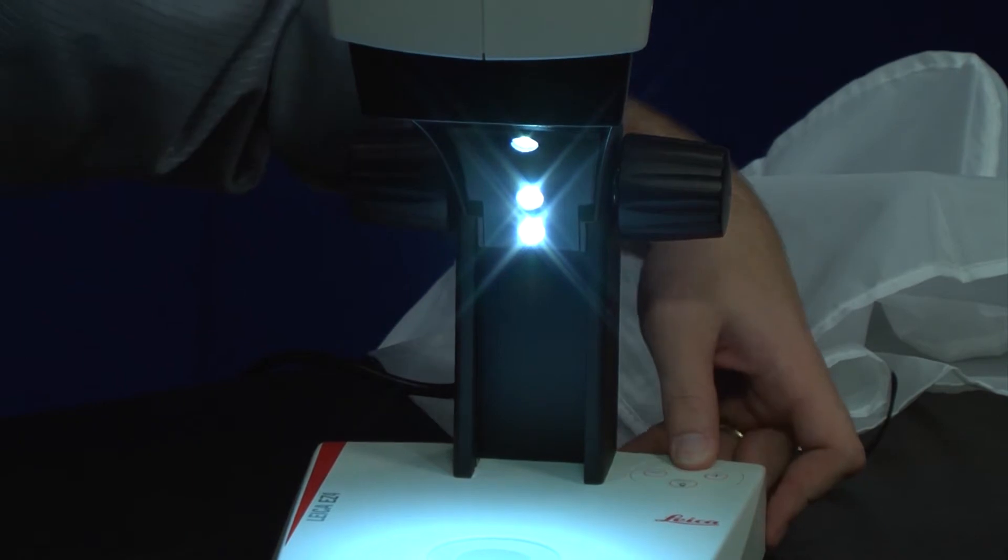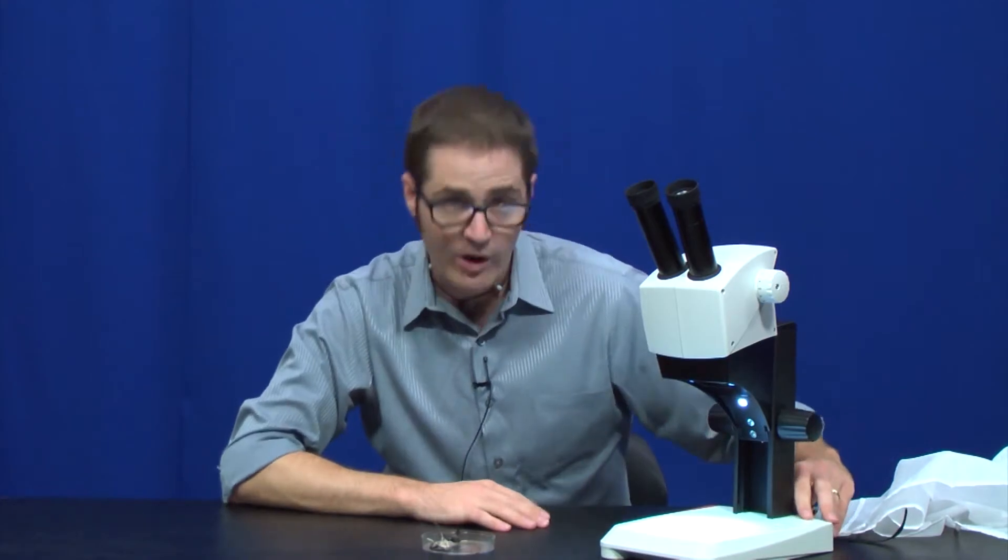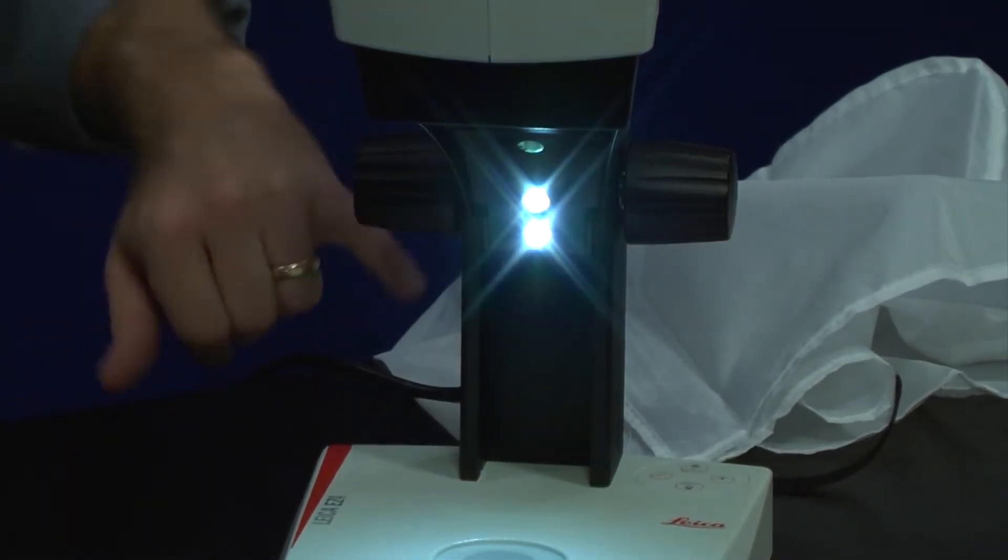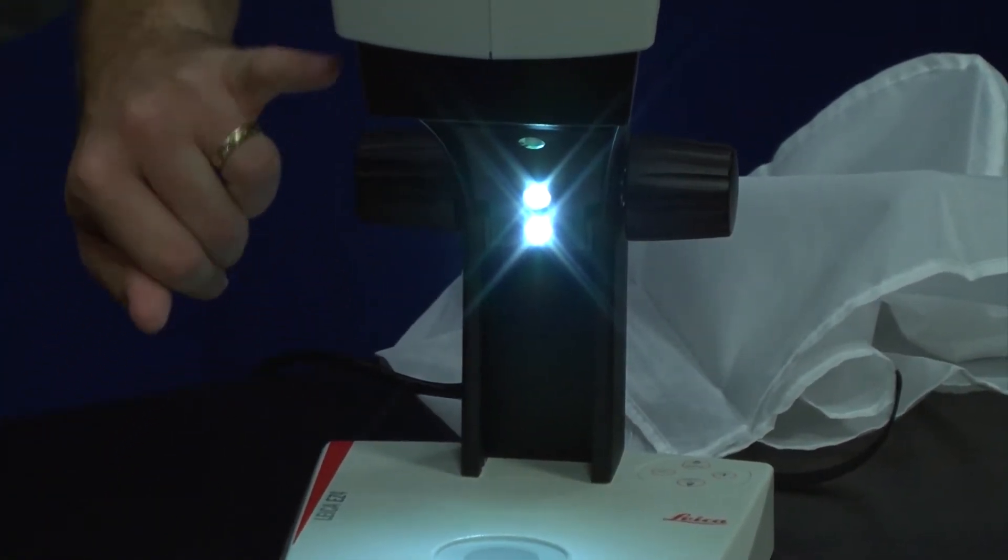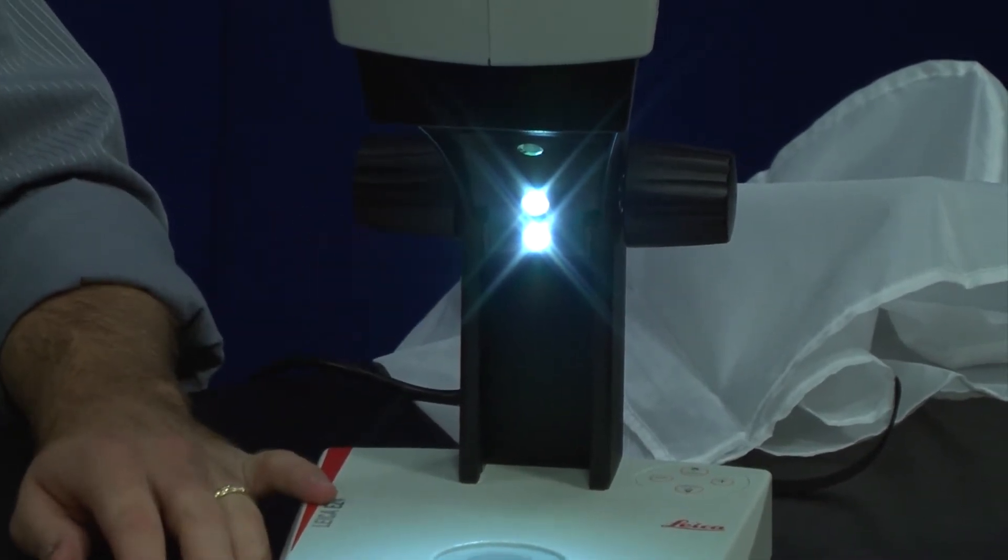When I hit the button the second time, it's going to turn off the bottom two LEDs. That's going to give us a really nice top-down illumination without casting any shadows from the back. And then if we're looking at maybe a smoother surface or a rock, for example, we can hit the button a third time and we're going to turn off those upper three LEDs and turn on the bottom two, giving us a little bit of an angled light that really shows surface defects, scratches, and topography very nicely. If I hit it one more time, that'll turn the light off entirely.